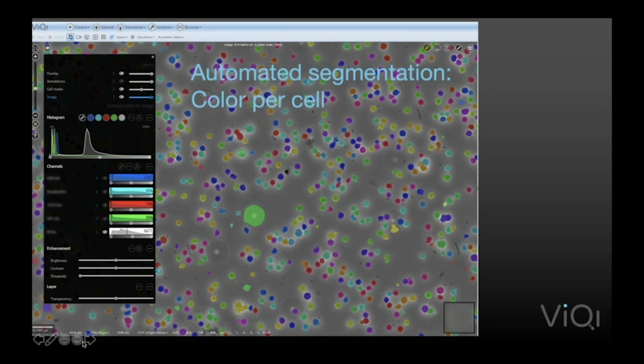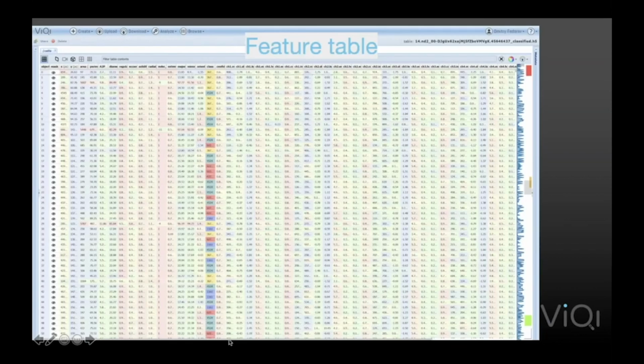And in the next slide, we see what it is that we're actually sending to the AI. When you click on cells, or the segmentation algorithm identifies them for you, you can extract a lot of standard descriptors of these cells. There's the image mask, the individual pixels that comprise the cell. And you can get various kinds of textures or the perimeter shape or form factors, etc. Those are natural numerical descriptors of what these cells are. And so, these are all in these different columns here.